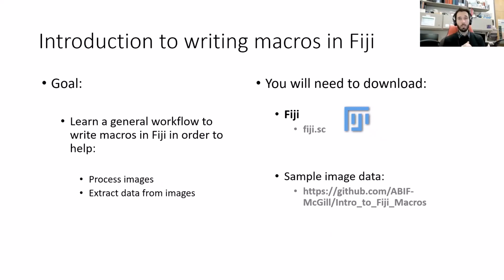For today, you'll need Fiji, so fiji.sc, the links are in the GitHub, and we just made a few sample images of DAPI, phalloidin, and mitotracker, which are available on the GitHub here, so you can download that fairly easily.